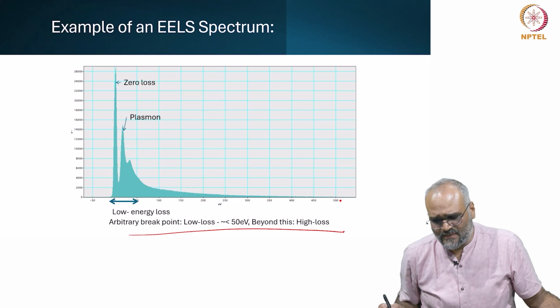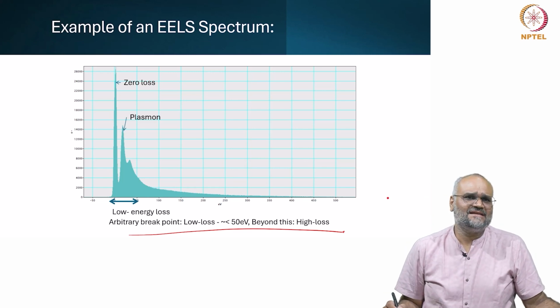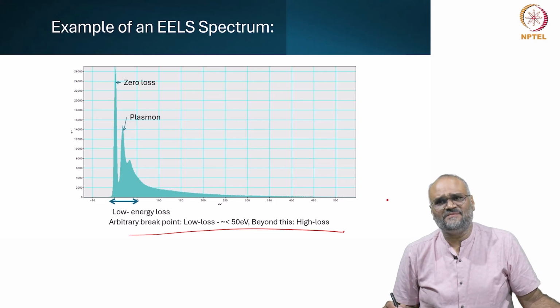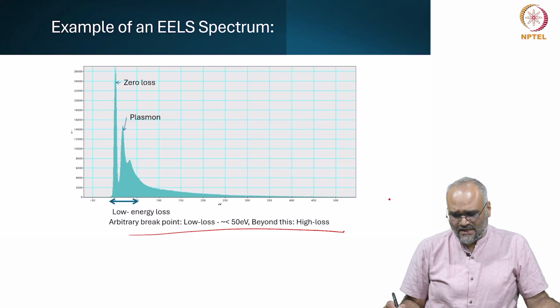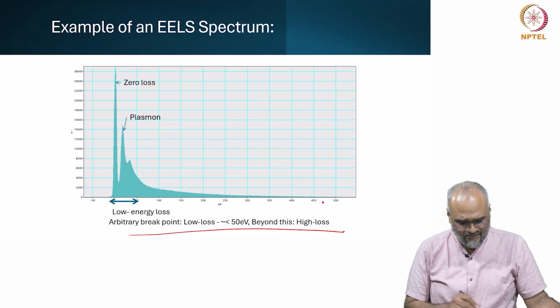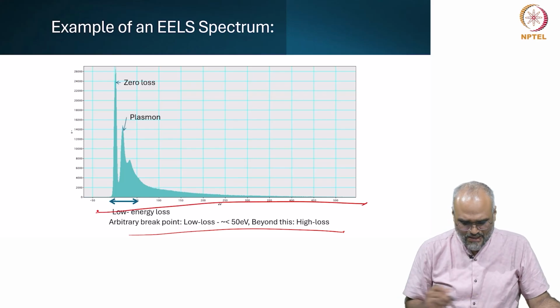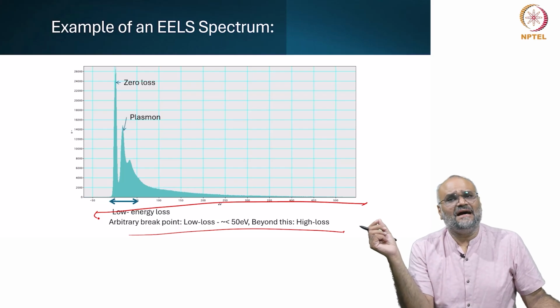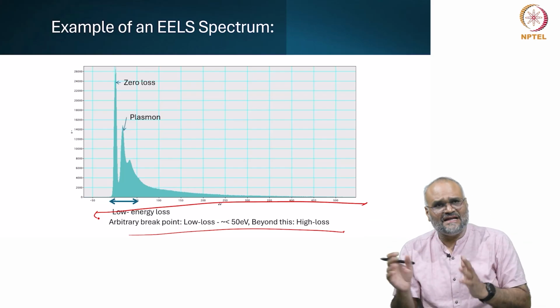In the spectrometer, this is essentially a CCD camera, or nowadays people are also using a CMOS based camera as well. You record typically on a 1024 eV window here. Depending on how the energy dispersion is, I can record within specific ranges.